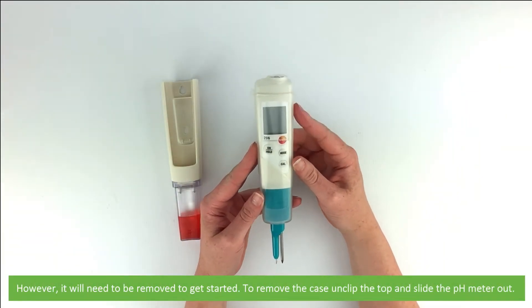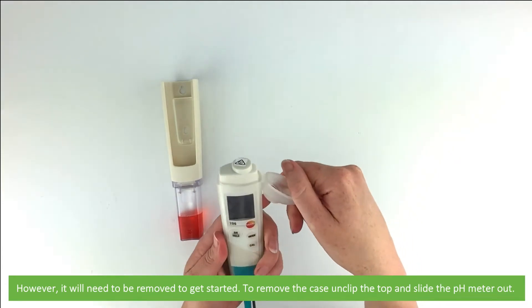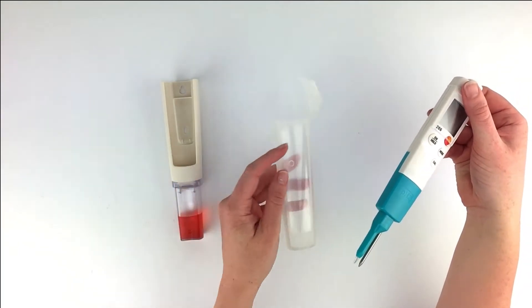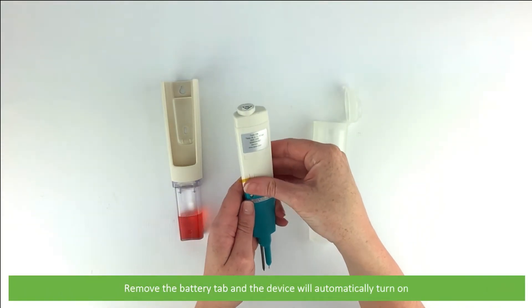Instrument Choice recommends you always use the meter with the cover in place. However, it will need to be removed to get started. To remove the case, unclip the top and slide the pH meter out. Remove the battery tab and the device will automatically turn on.